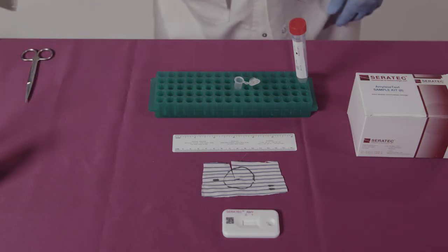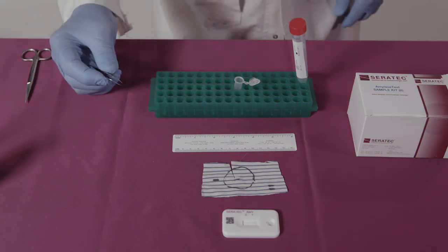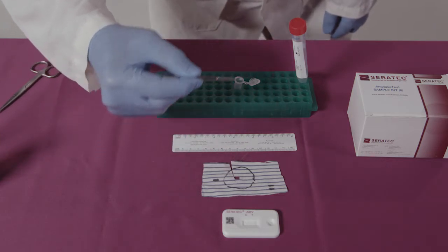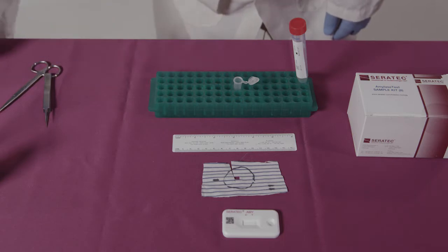Prepare an extract of a stain by cutting out a 5 millimeter by 5 millimeter area and extracting for 10 minutes in 300 microliters of the standard buffer at room temperature.